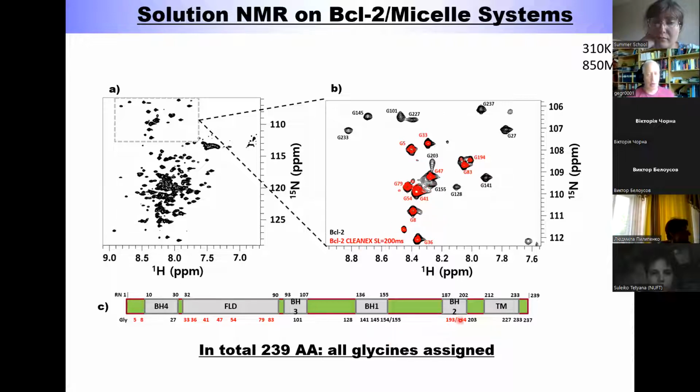The red ones all have contact with the buffer. All the others, the black ones sitting inside the micelles, are protected like in a bilayer, but the red ones can look out and have a little contact on the surface with water, and are also often more flexible and often also sharper.